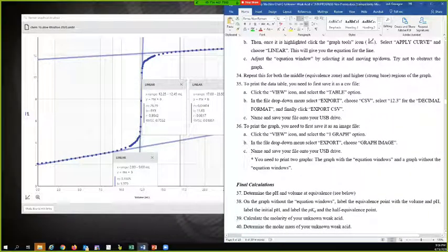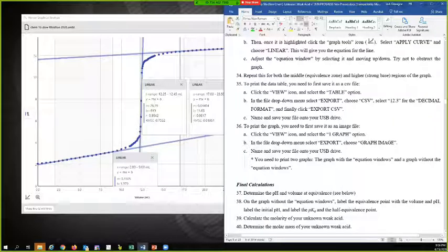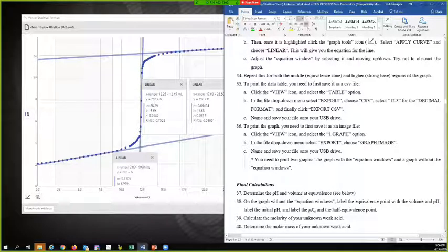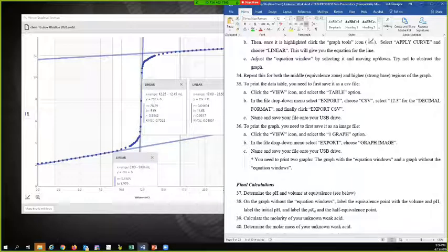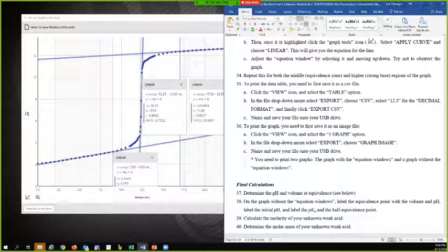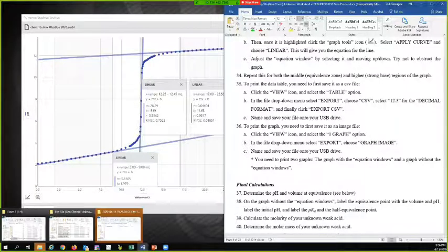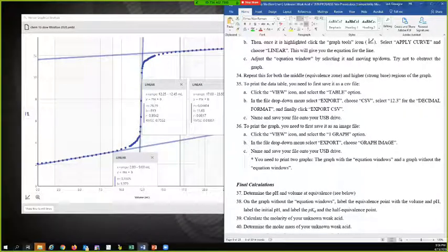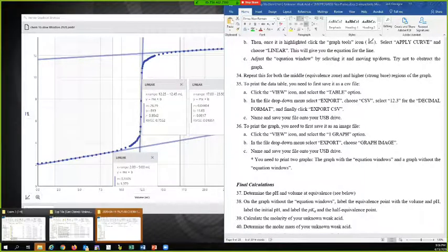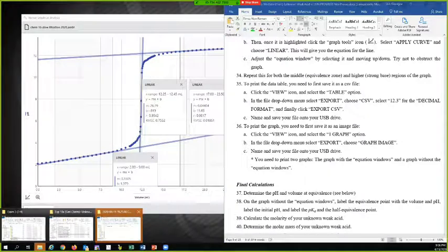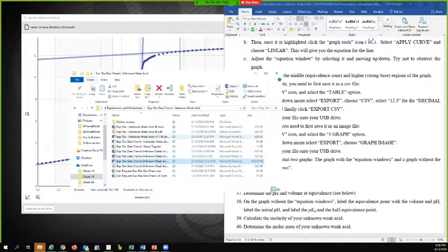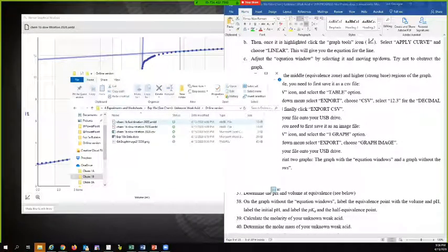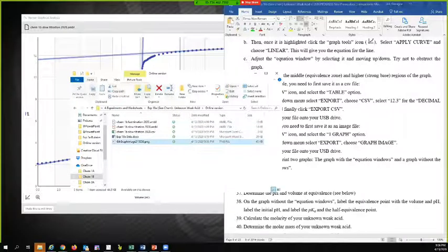So you need to print two graphs. The graph with the equation windows and a graph without the equation windows. My guess is that the one I saved has all the stuff on it. I'm going to go over there and look at it.